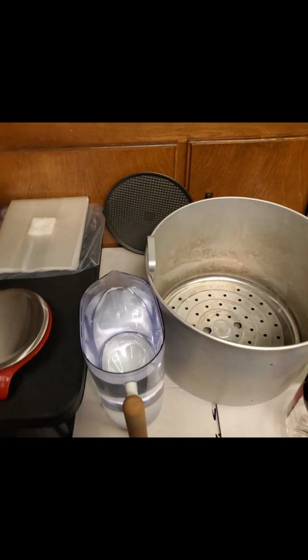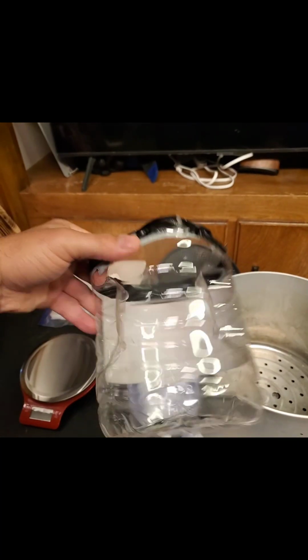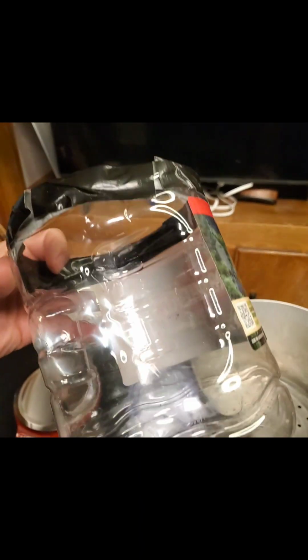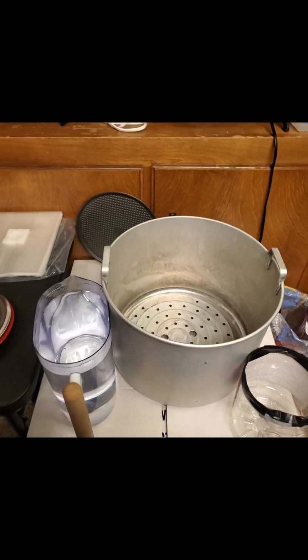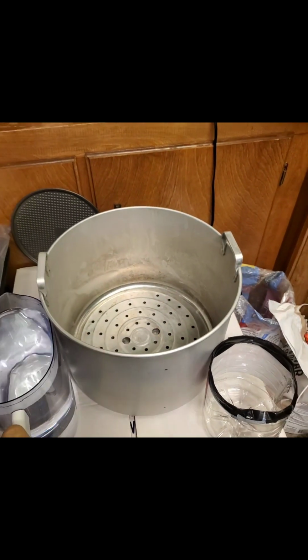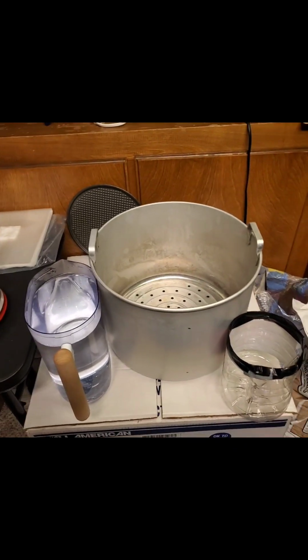So let me go ahead and show you this here. I cut that and put tape around it. Get a good couple big scoops. Usually I can get it in one big scoop, but I pretty much just do 2 scoops and can get it into the bag. I made that myself. And yeah, just giving you all the first look at how we're using this sterilizer from the All-American. And let's get rocking.